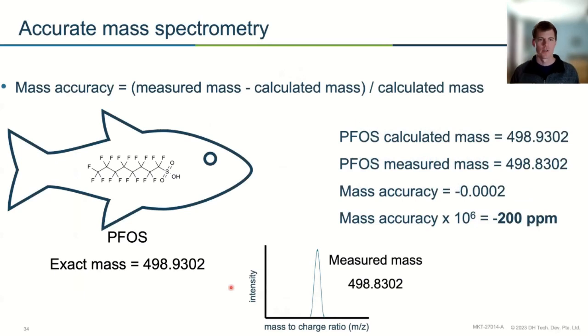Okay, so the next term is mass accuracy, and these two are just as important to one another. So resolution is how narrow those peaks are. Mass accuracy is really how confident we can be in our measured mass. You'll usually see high-res data to 4 decimal points, maybe to 5 decimal points. And to me, that's what I think about as accurate mass spectrometry. Once you say spectrometry a lot, it gets really hard to say.